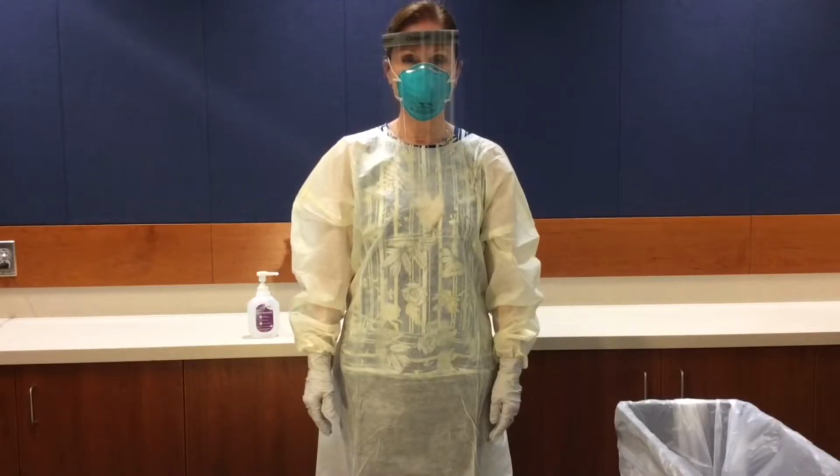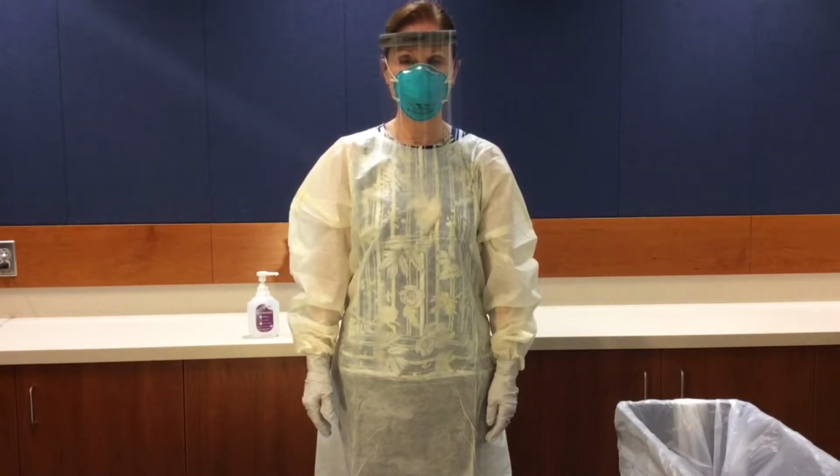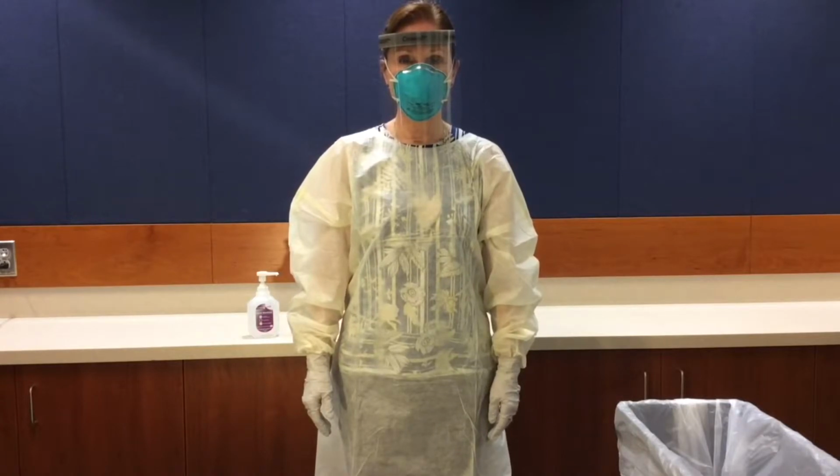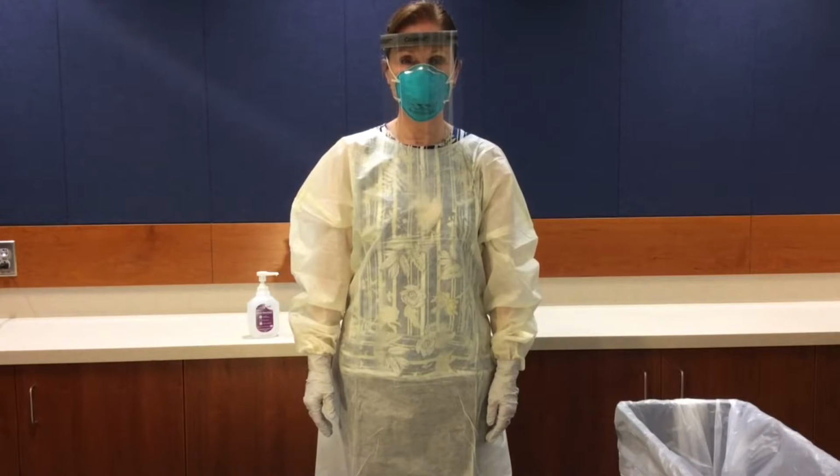If there is no anteroom, gown, gloves, and face shield or goggles are removed and discarded near the door just before exiting the room. Respiratory protection should remain in place until you are outside the patient's negative pressure isolation room.